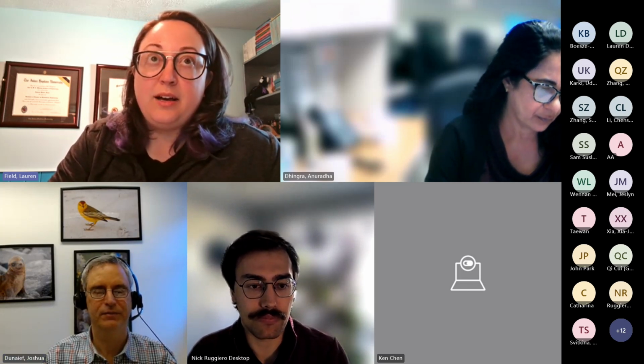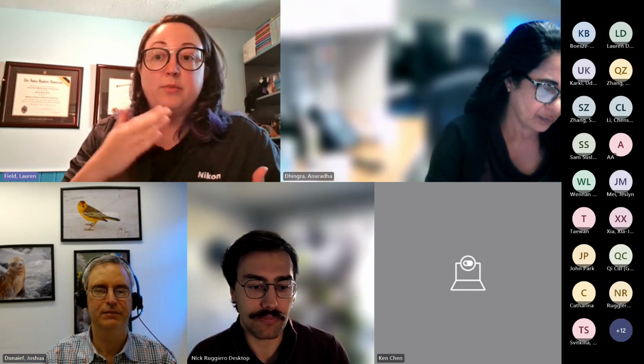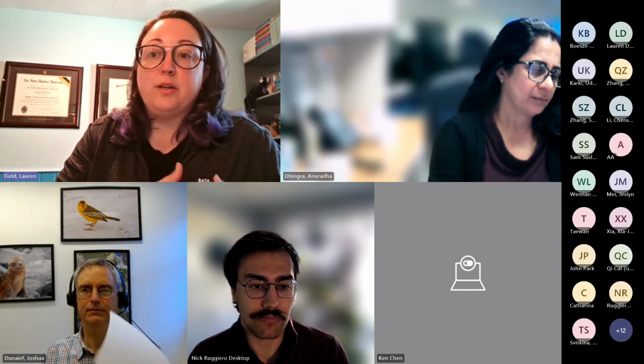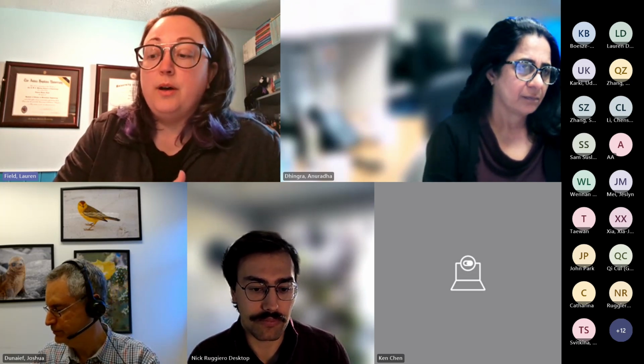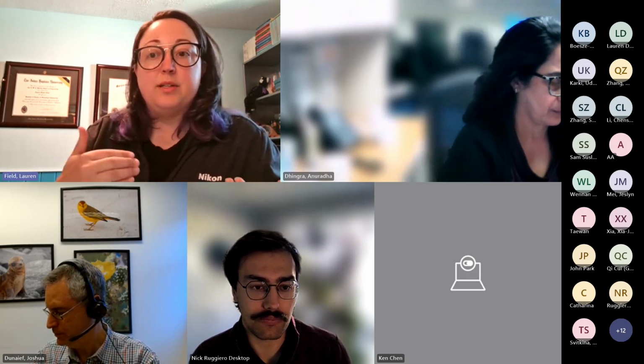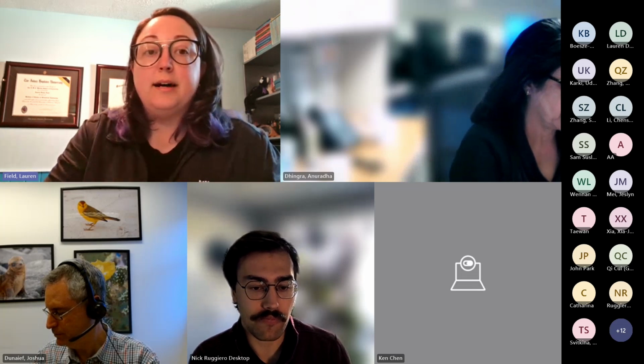our end. The AI algorithm that we have produced, that we know is quantitative both pre and post processing, is denoised. We have a white paper that we've published for that so that you could submit it to whoever you're doing your submissions to. With Clarify and Restore, they're trying to get more confocality out of an image that you took in a widefield.